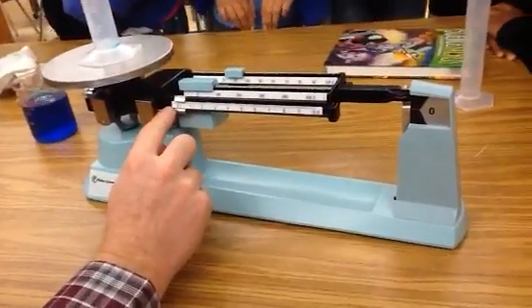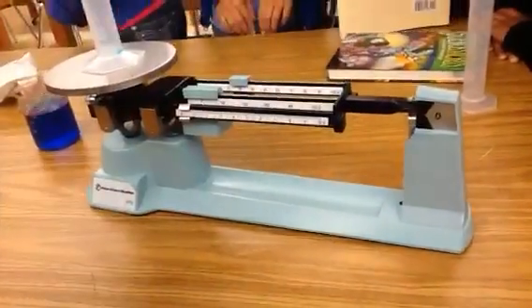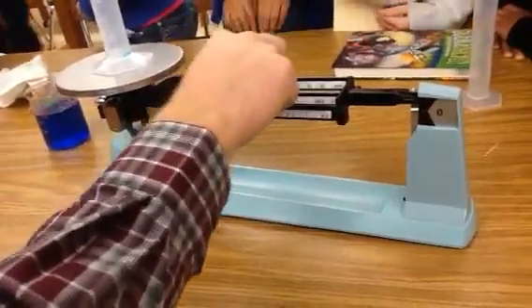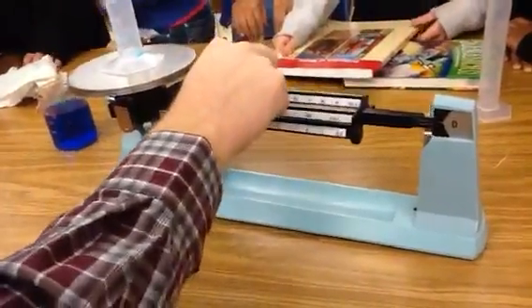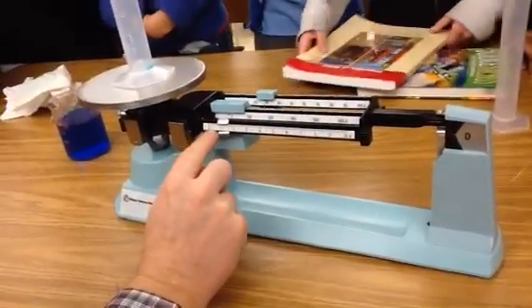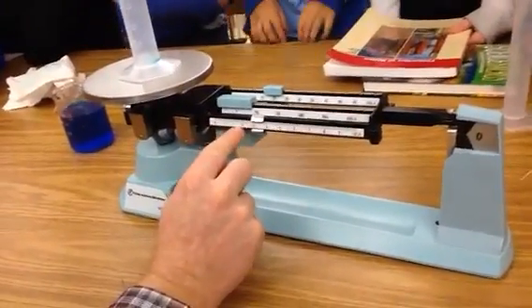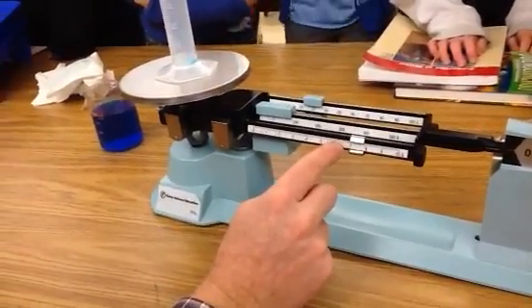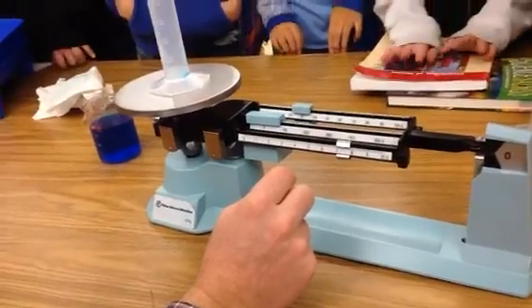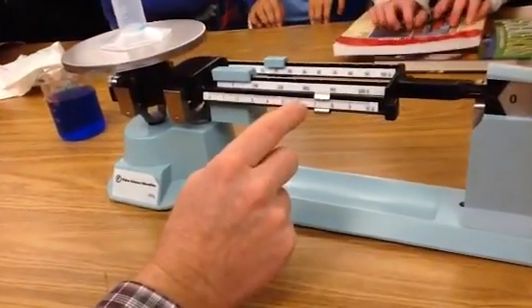Now we're going to do the ones. Always make sure that this is in the groove — it has to be in the groove. Then you have to move this until this evens out. And I think it's going to be about 37 and a half. A little bit more maybe.